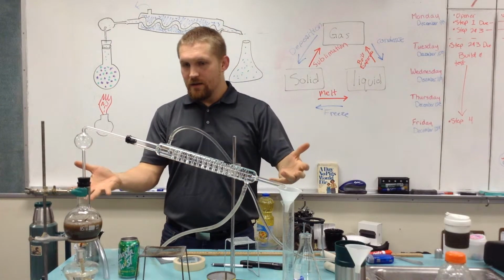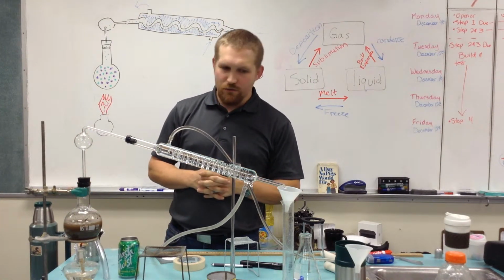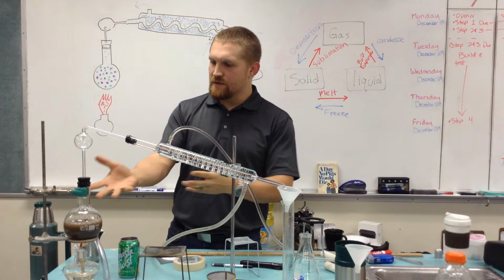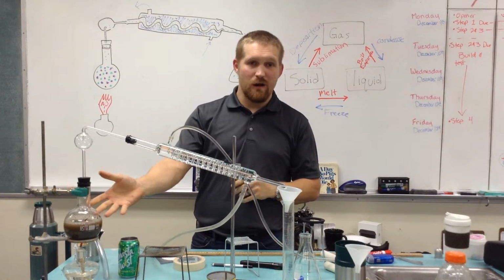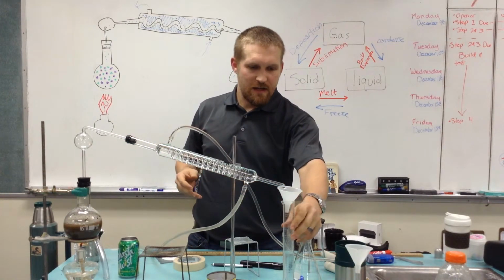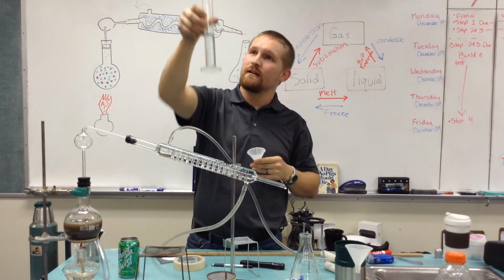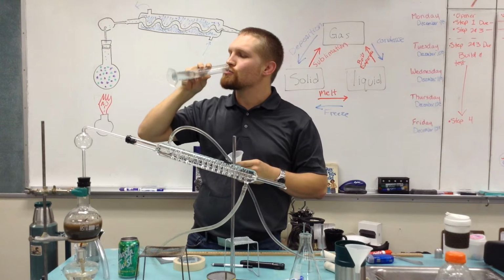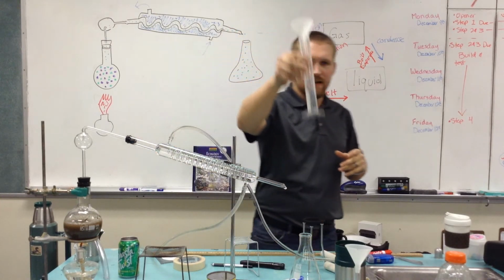So again, here's our cool distillation device. We start off with muddy, gross water. Comes up here as a gas. It goes through the condenser. And what started as this water that you would never want to drink becomes this nice, fresh, crystal clear, delicious water. And it tastes fine.